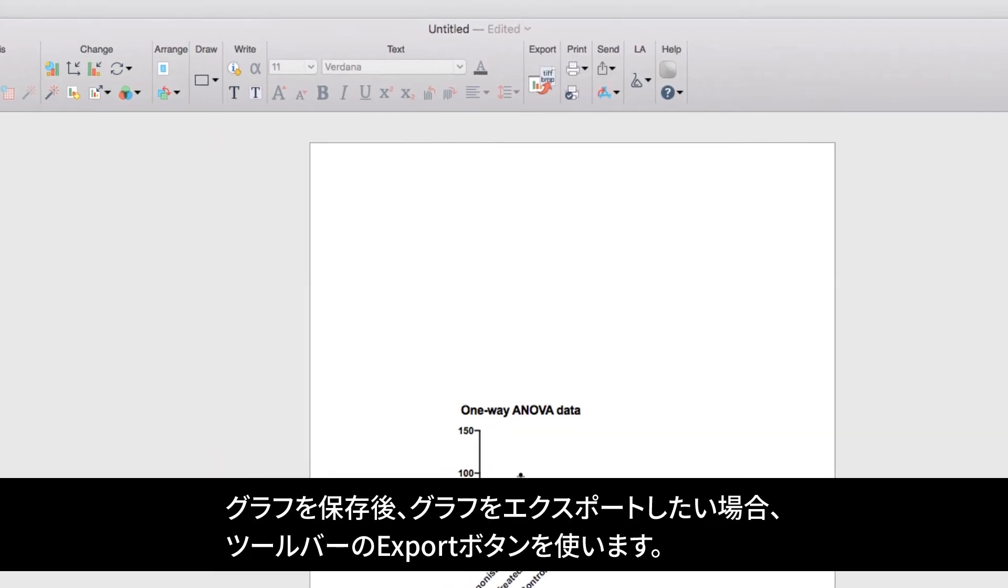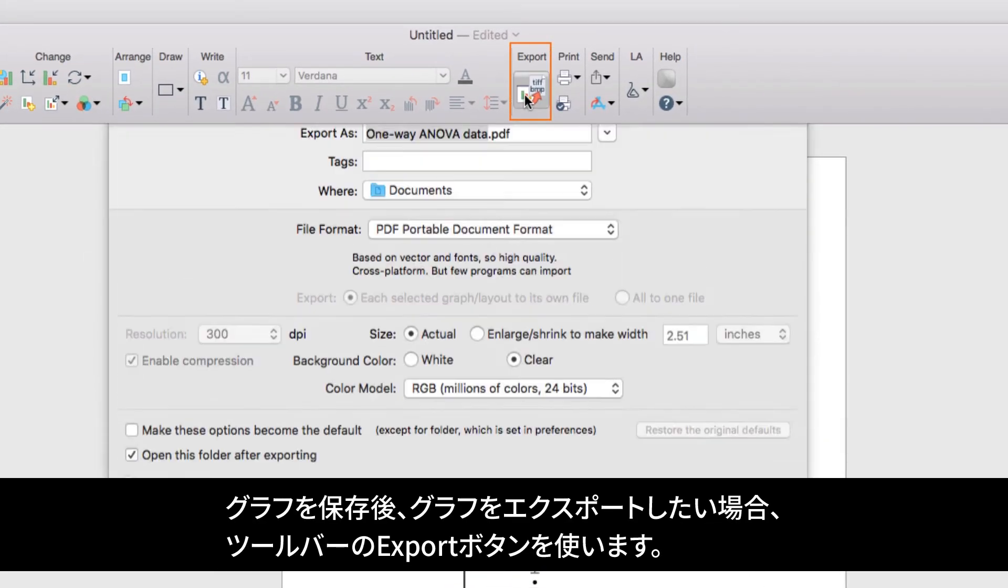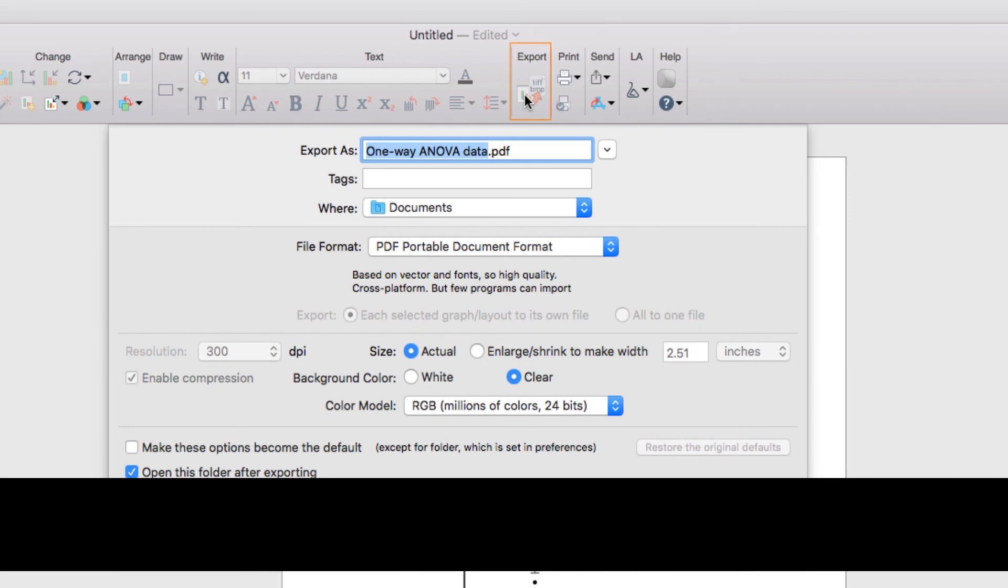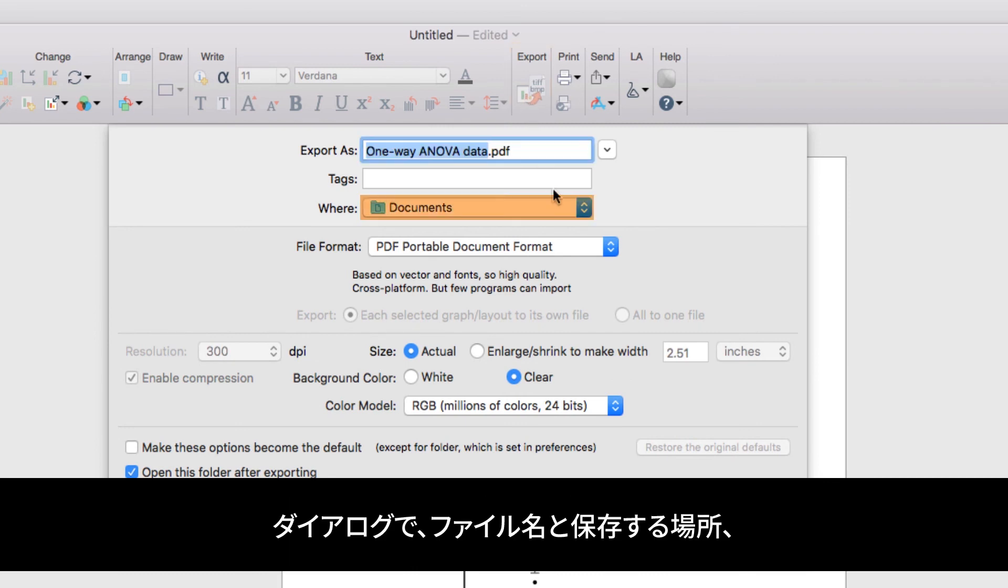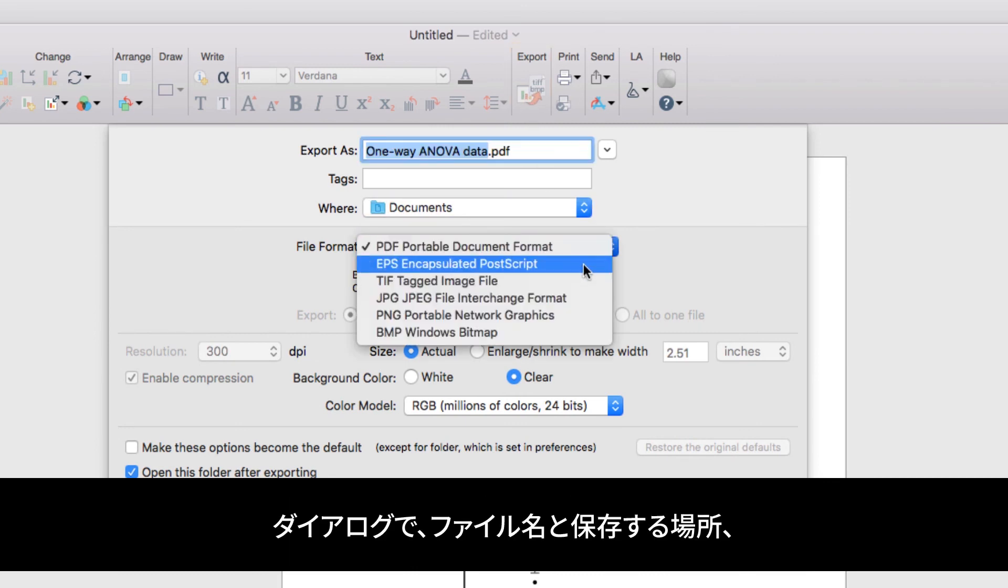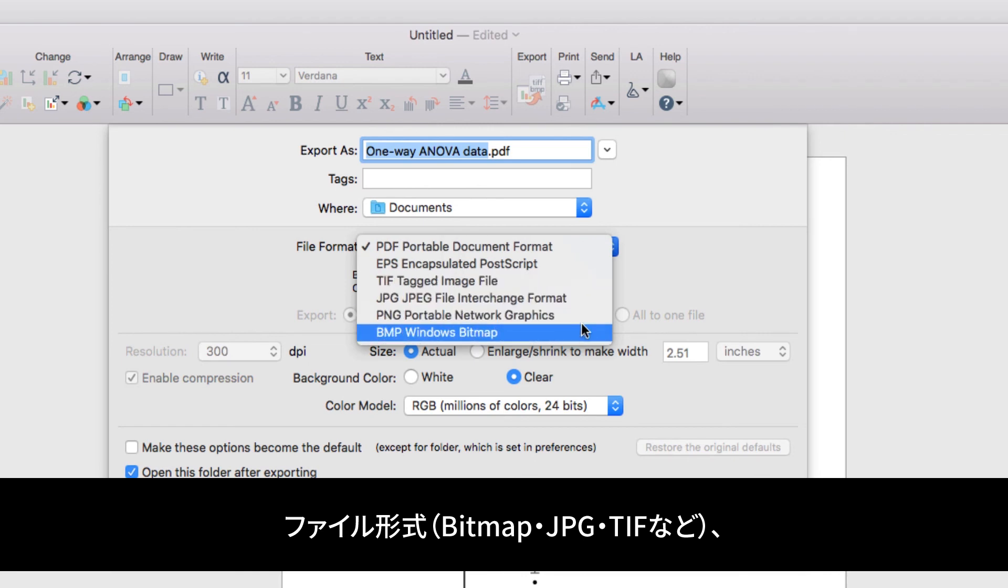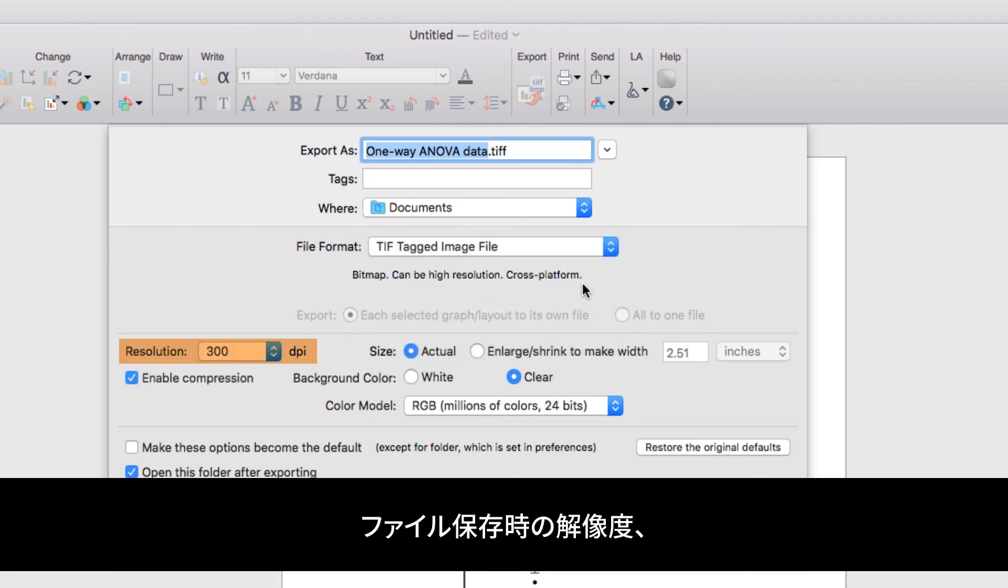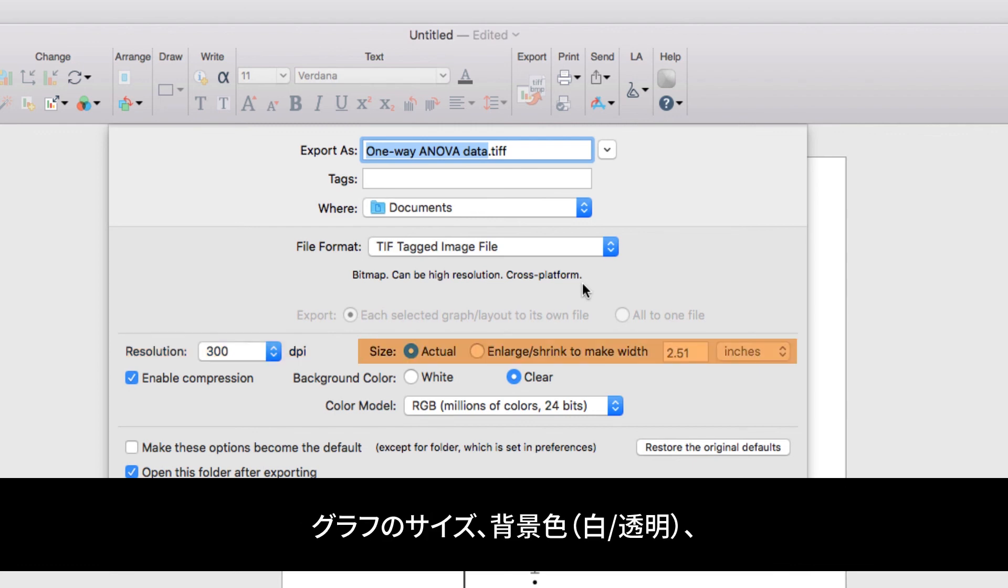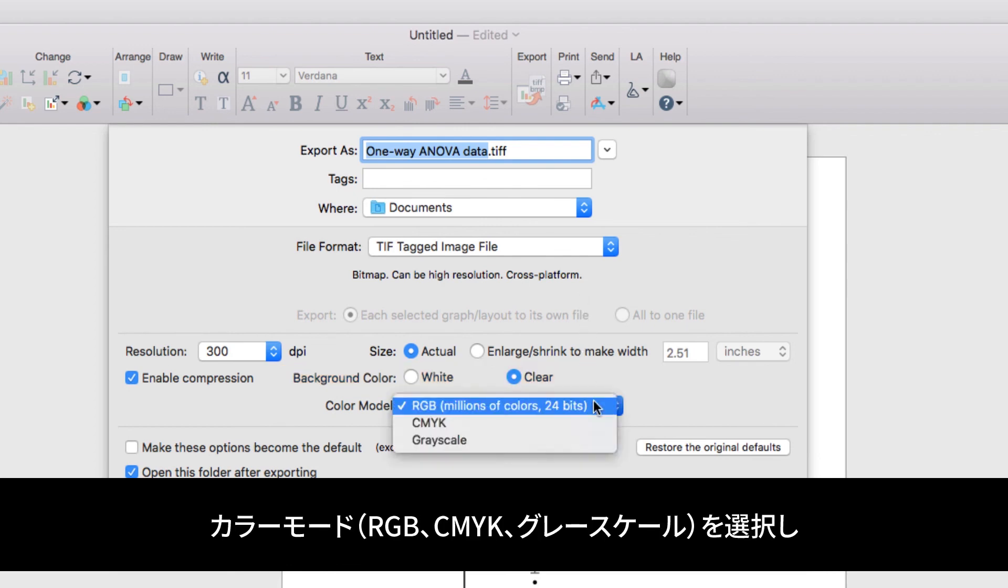Once you have your graph saved the way you like it, you can export it using the export button in the toolbar. In this dialog, you can assign a name and a file location to save your file, choose the type of file that you'd like to export such as a bitmap, a JPEG, or a TIFF, select the resolution that you'd like your file to be saved at, the size of your graph, and also whether you want your background to be white or clear, and your choice of color space including RGB, CMYK, or grayscale.